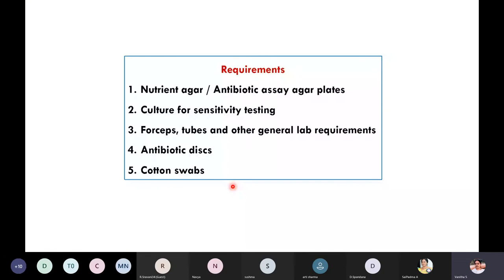These are the requirements. Generally we can use nutrient agar media for the experiment, but there is also one more media we can use, called Muller-Hilton agar media. Depending on the choice of your organism and the antimicrobial agent, you can use either the simple nutrient agar media or the special Muller-Hilton agar media.